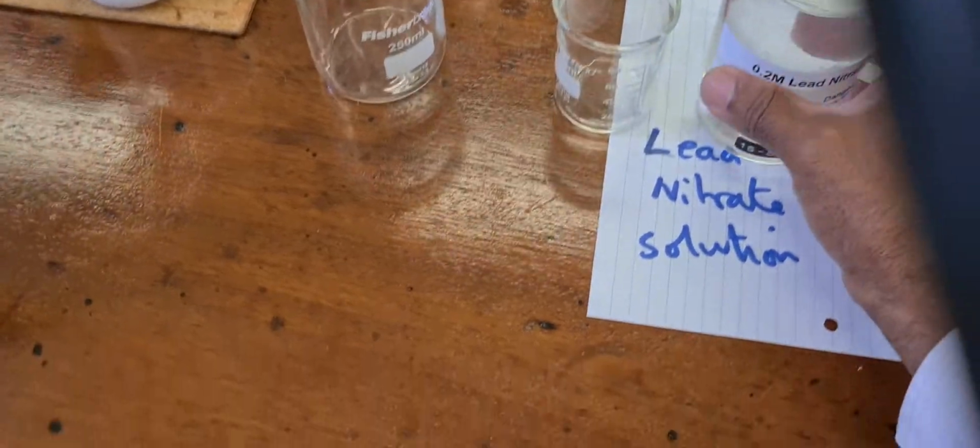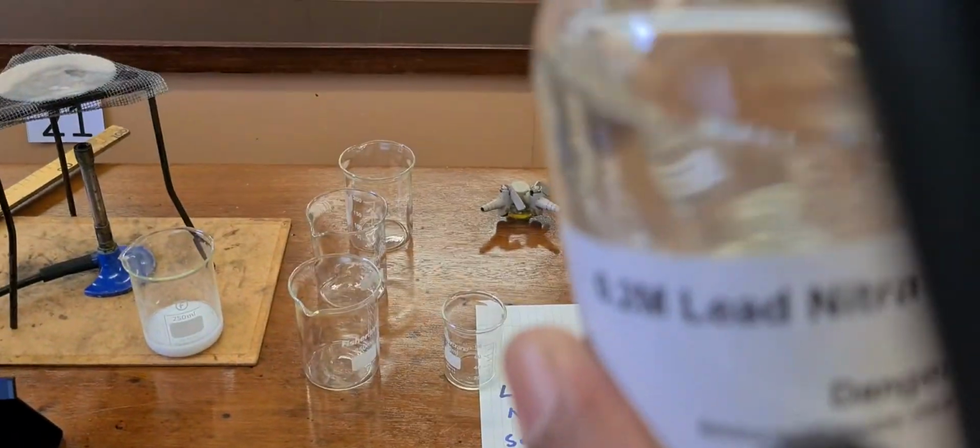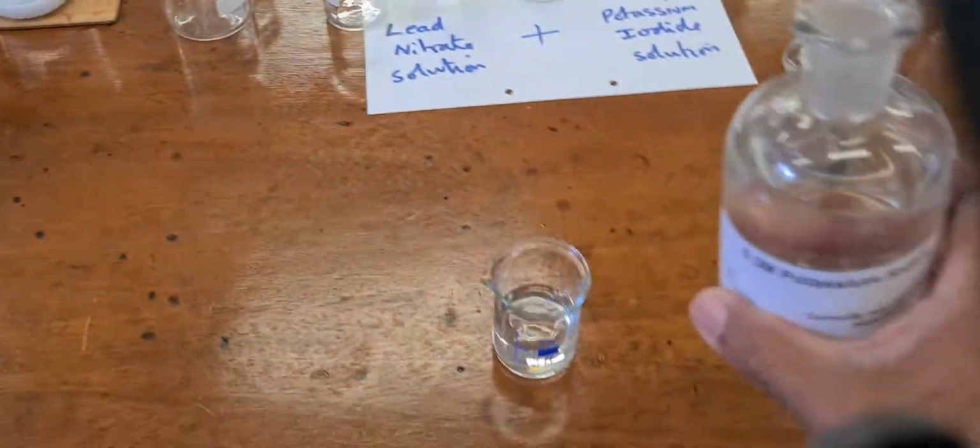So, lead iodide made by putting lead nitrate, there's lead nitrate, with potassium iodide, look.